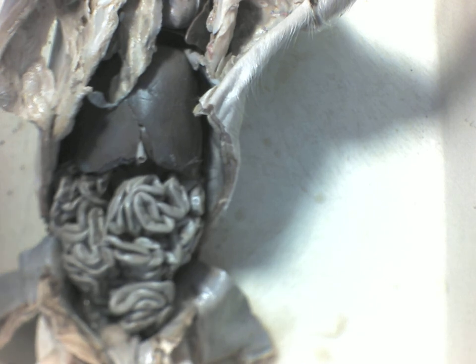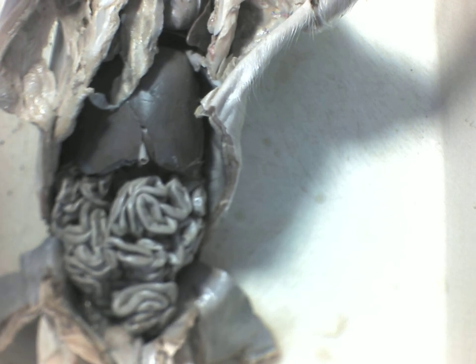Where will the waste be stored until it's ready to be eliminated from the body? In the rectum. Very good. Stored in the rectum until it's ready to be eliminated from the body.